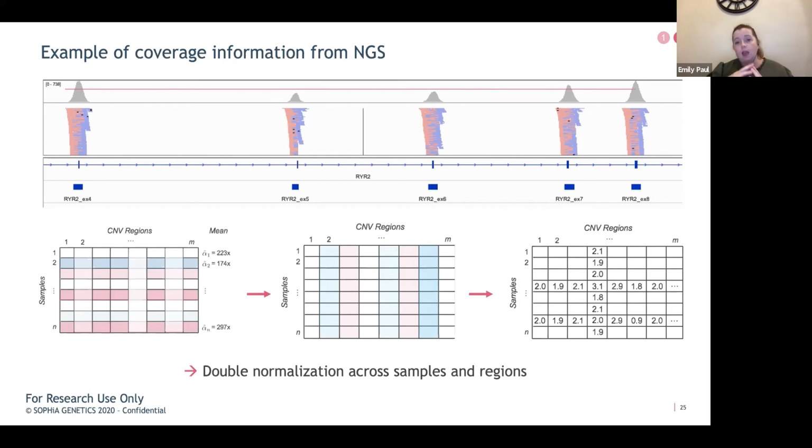So in fact, the algorithm detects from those 8 samples that are processed together, which ones work as the best reference samples for that run. And here they're largely looking at coverage for the assay itself. Now we're going to take those reference samples that we set, and then we're going to be able to target and look at the CNV detection through a hidden Markov model and be able to identify them.